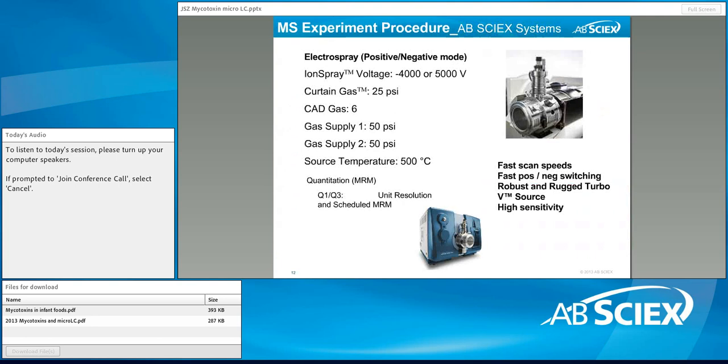Okay, so a SCIEX 5500 QTRAP instrument was used here, and on the left side you can see the source conditions we used for both positive and negative ionization modes, gas condition and temperature.